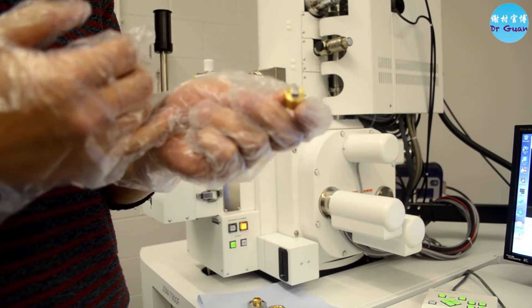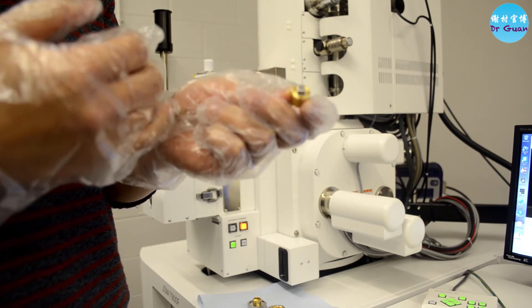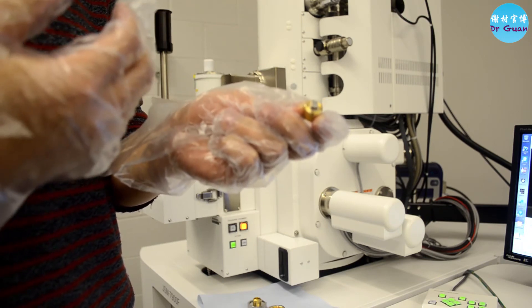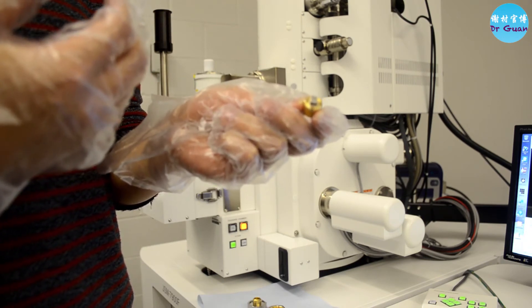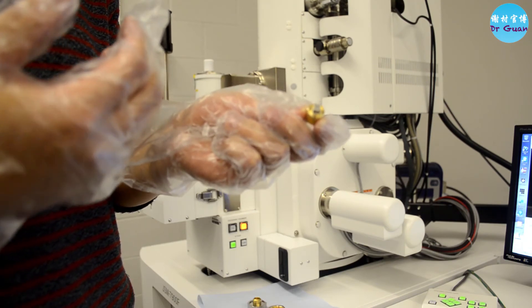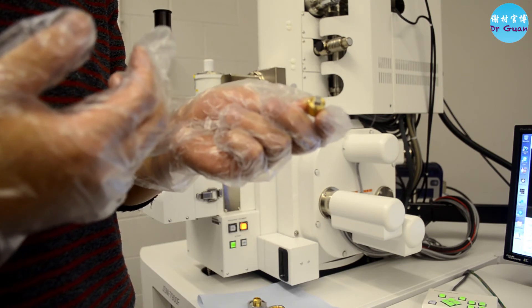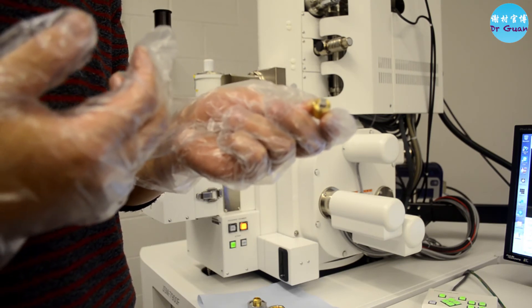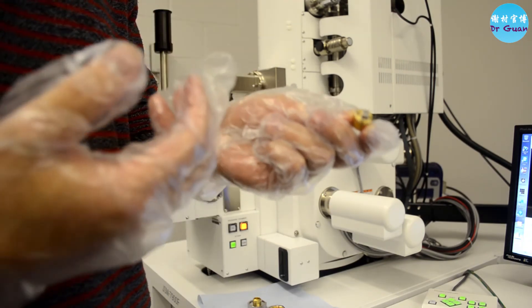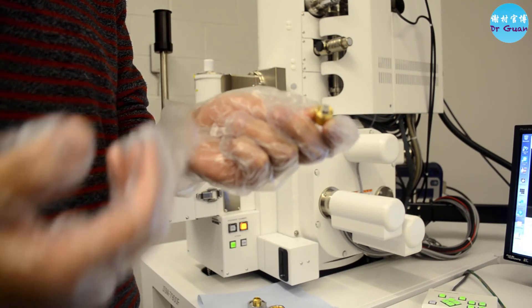Another advantage of using silver paste is to avoid carbon contamination. When you focus the beam on the sample, the carbon sticker can be vaporized or damaged during the vacuum or electron beam scanning. So my suggestion is to avoid using a carbon sticker if you can, especially for EBSD runs.